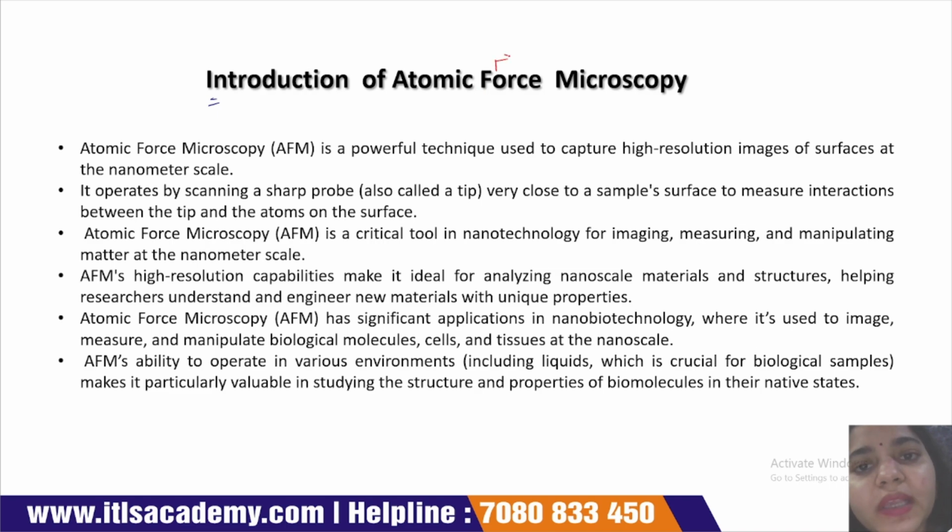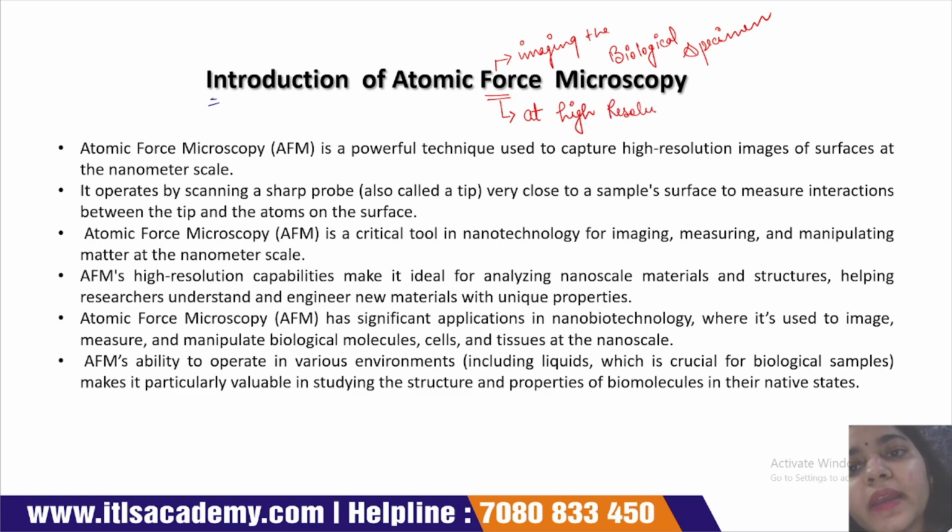Atomic force microscopy is the type of microscopy which is used for imaging biological specimens. With the help of this atomic force microscopy, we capture images at high resolution.